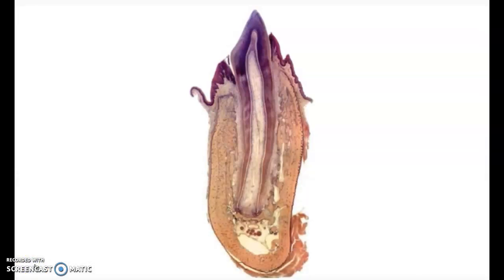This is a slide of the tooth. The correct magnification is about 10x of the total magnification. But we'll look for the various features of the portion and parts of the tooth. So before we zoom in, this top portion is what you look at on someone's tooth.